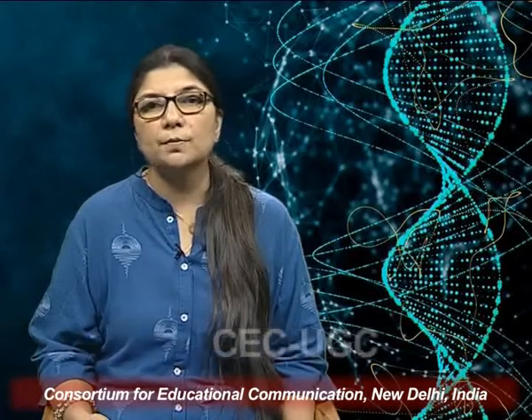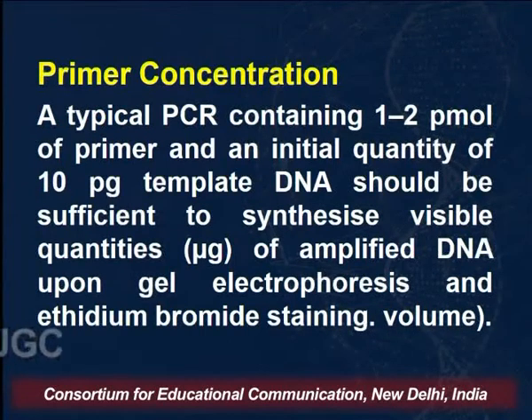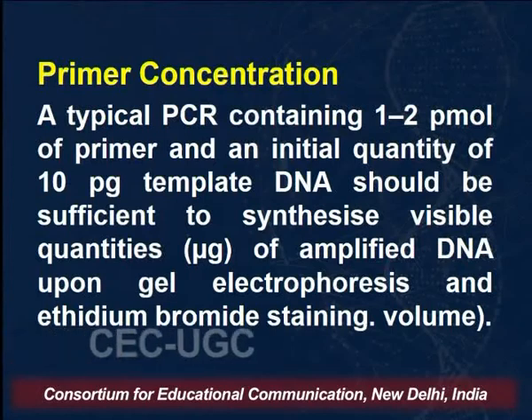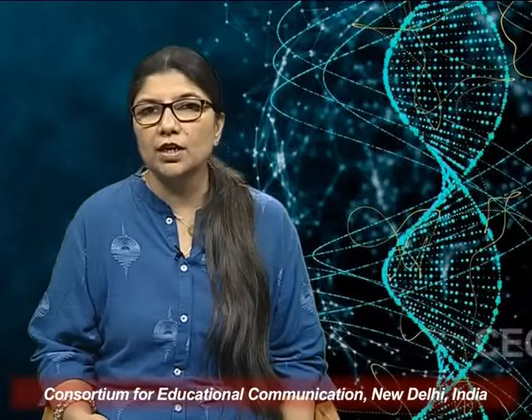Primer concentration is also very important. A typical PCR containing 1 to 2 picomole of primer and an initial quantity of 10 picogram template DNA should be sufficient to synthesize visible quantities, that is in micrograms, of the amplified DNA upon gel electrophoresis and ethidium bromide staining. So again we have to find out how much primer we need. So, 1 to 2 picomole; we should know the concentration of the template DNA that we are using. Accordingly, we will use the amount of primer, and therefore we should have a product.